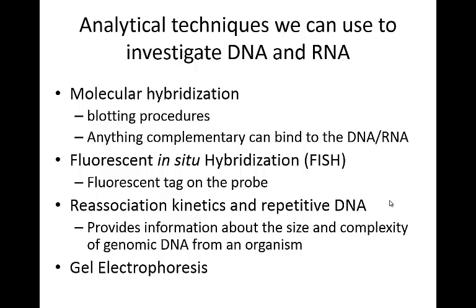We'll talk more in a minute about gel electrophoresis, but you can separate them out based on size, and you can know that this is going to be very, very specific binding. You can take this one step further. Instead of using radio labeling, you can use a fluorescent tag on the probe instead.